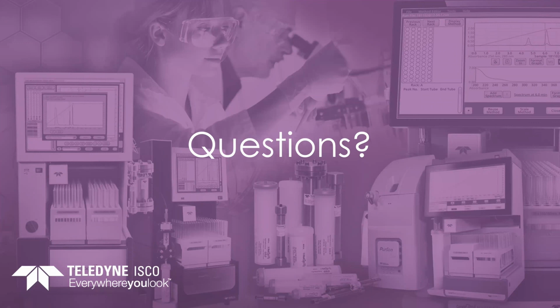Does the column type affect the calibration? No, only the size of the column. Within the PeakTrack software, we adjust for the column size so that we can scale up or scale down as needed without additional calibrations.